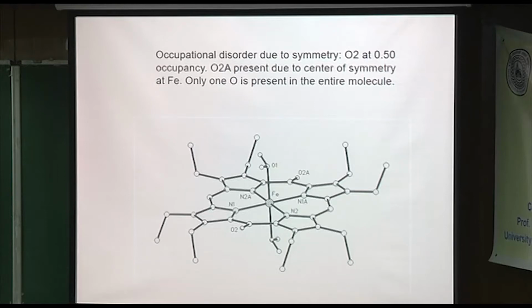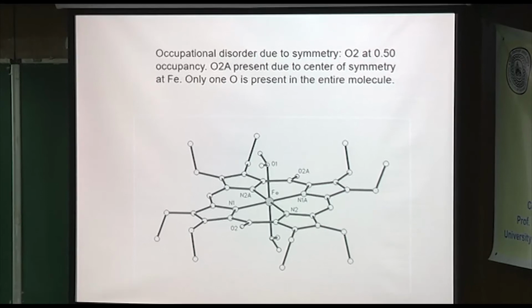So the only way around that is to set the oxygen and its two hydrogens to half occupancy so that you're not overstating what is there. Just in the atom list, you set site occupation factor 10.5 instead of 11.0. And you have to personally do that because the software won't do it for you. You have to set the occupation to what you know is reasonable, and then the thermal parameters will look good, and it will converge, and it will be very good. So that's just a really simple example, and not the worst kind of disorder that you encounter.